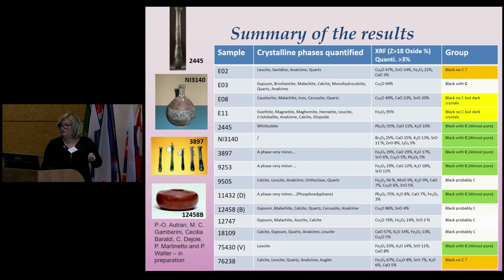You can focus your attention on the green. We could have a good result, and I found the black carbon in some samples. Usually these black carbons were vegetable. We are not so lucky here to find the bone black.